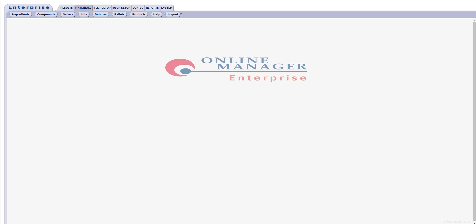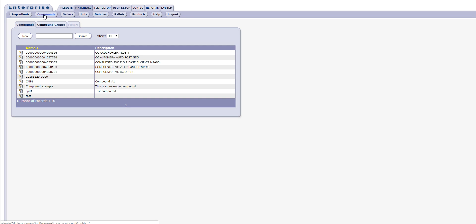As is the case with all the tabs in Online Manager, selecting the Materials tab presents the user with a row of buttons. The Compound button is the second from the left under the Materials tab. Clicking the button enters Compound Management.